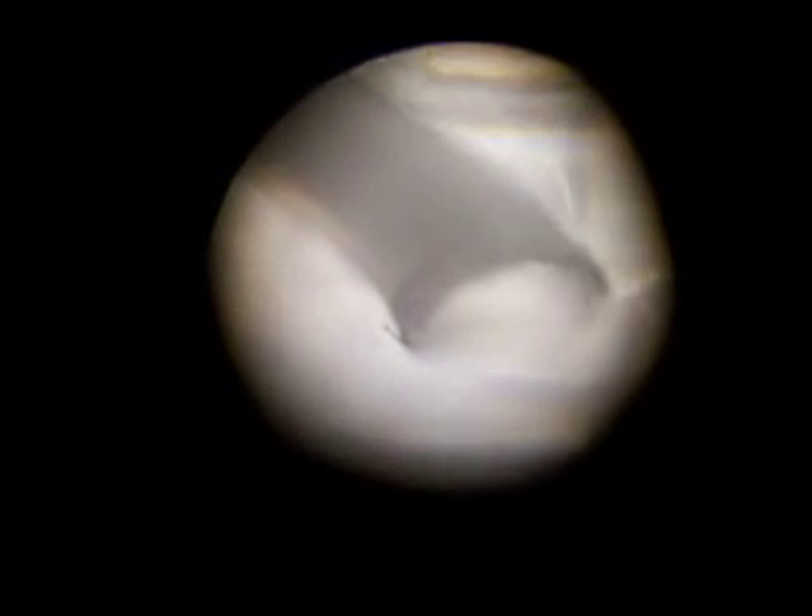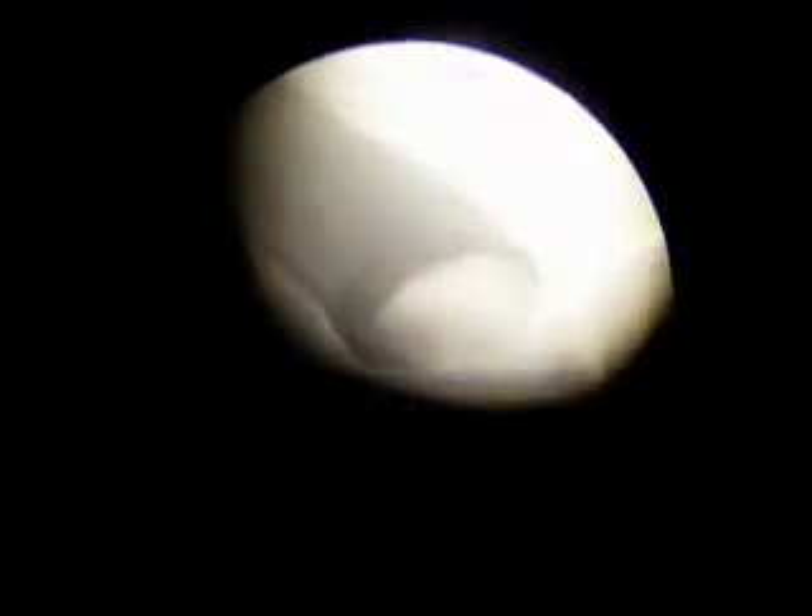This is my snake's tooth under the microscope. It's the base — you can see how it's almost hollowed out there. It's been out for a long time. There's a little chip in it too. I'll see if I can get a better image of that. Snake tooth. Bollie's snake tooth.